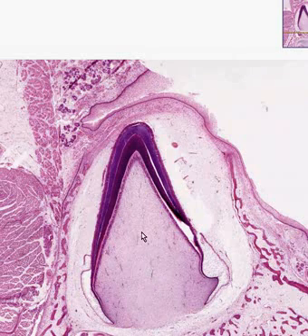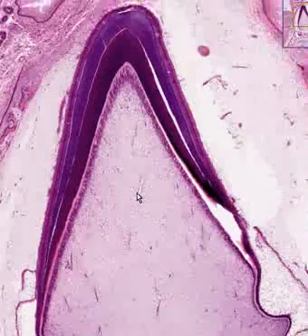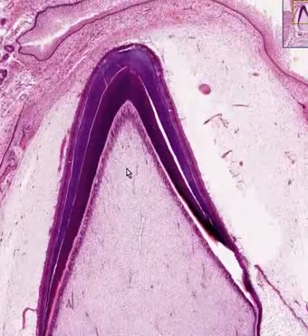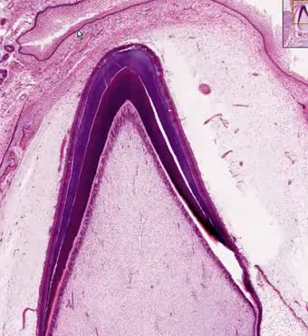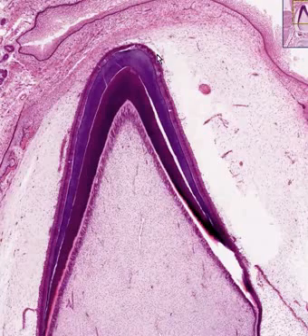Thirdly, you can see a nice loose vascular pulp cavity of the tooth, in which you can see basically a loose, primitive looking connective tissue and a lot of blood vessels, which you see along here. But the really beautiful thing is that even though this tooth has not quite erupted yet and is not projected above this surface mucosa, you can see two real dense lines here.